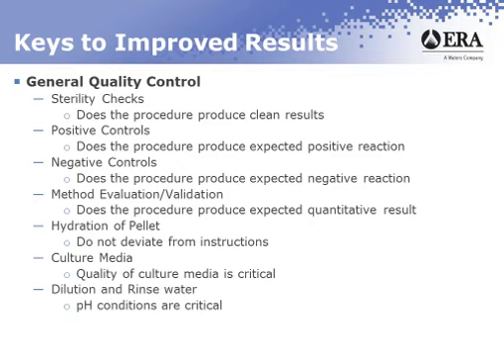Okay, dilutions and rinse water. As I'd mentioned a little bit earlier, pH conditions are critical. You only want to rehydrate the pellet that we provide you with the buffer that we provide you. All of our quality control, all the other participants, everybody is using that same buffer. You want to make sure that you use it as well. If you're doing any kind of dilutions or rinsing of your apparatus, you don't want to use just deionized water or distilled water. ERA, standard methods, general good micro practice is going to recommend that you're using phosphate buffer or peptone water.